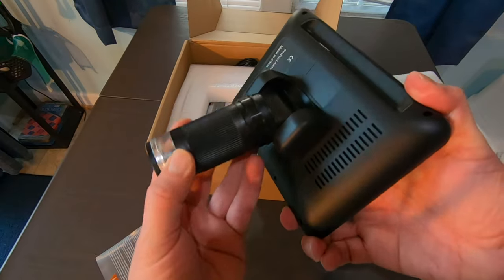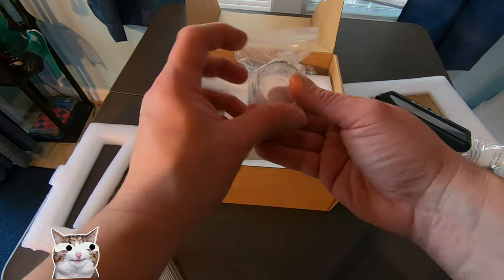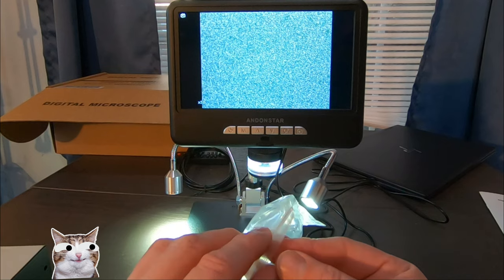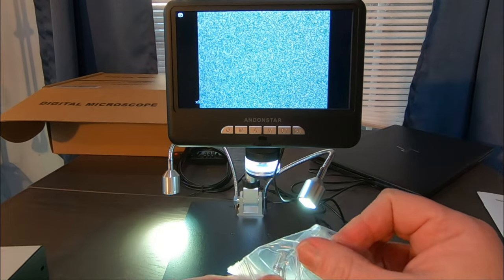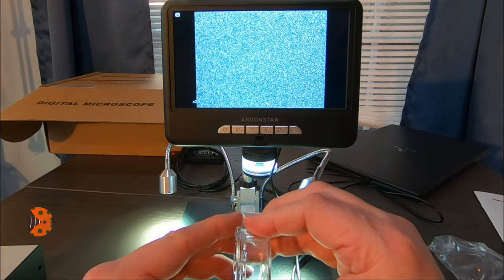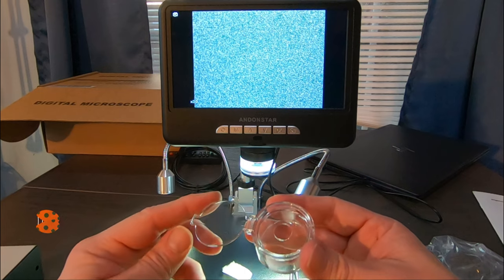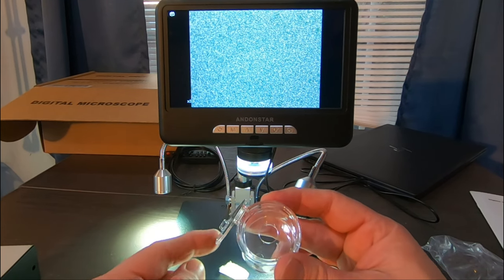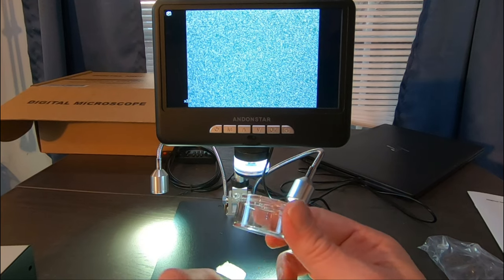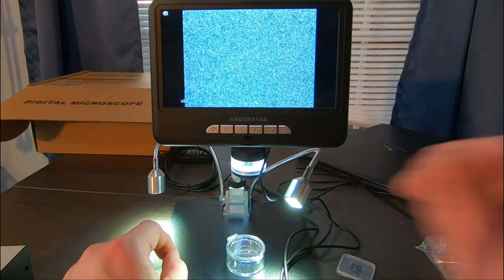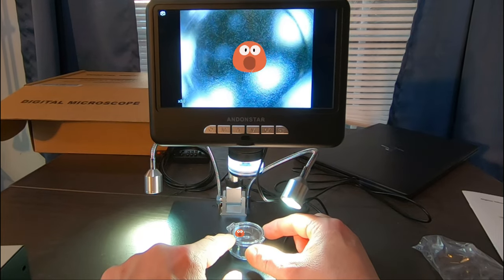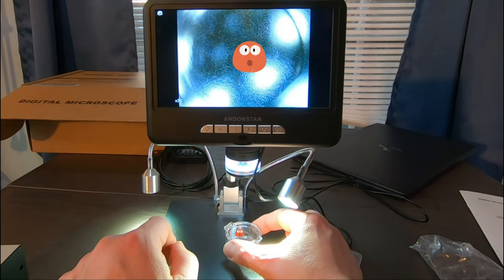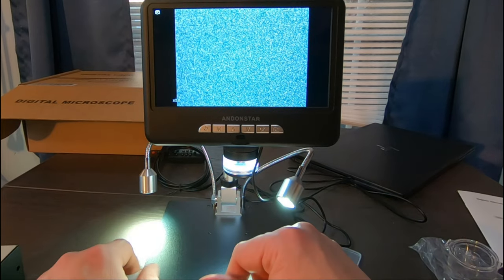It's up or down. All right. So we have a lot of delicate instruments here, guys. We want to be very careful. This is probably a little container. If you want to catch a specimen, whatever that might be, you can put it with a little critter inside there and then close it. And while they're walking around, looking around, you can look at them underneath of this. So that's going to be kind of cool.